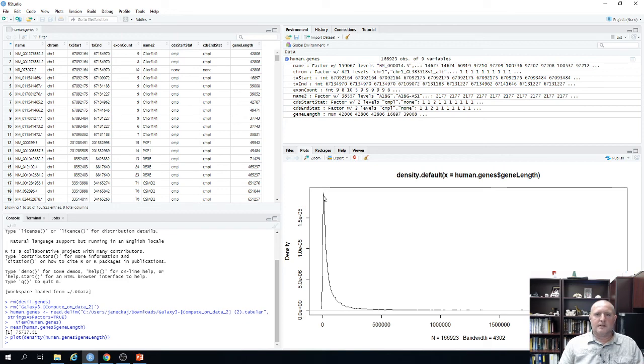Going through Galaxy is a great way to go because it allows you to do some basic analysis with the tables, and Galaxy also has a lot of excellent, up-to-date bioinformatics tools, so you can do a lot of complex analyses in Galaxy as well. And you can very easily download those data sets from Galaxy onto a desktop computer or local machine and get those into RStudio so you can do additional statistical analyses.